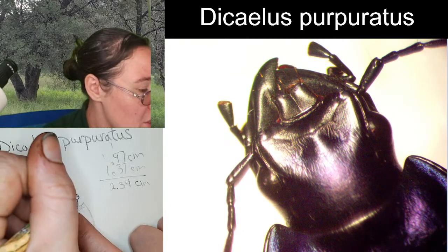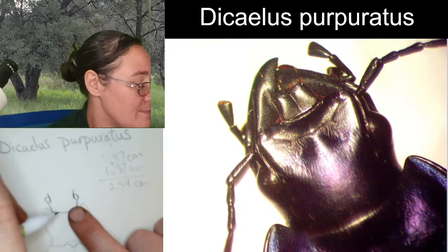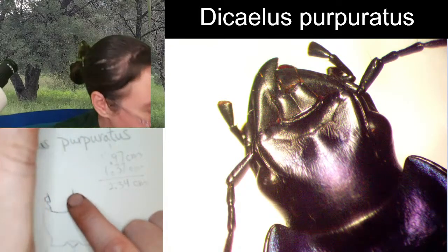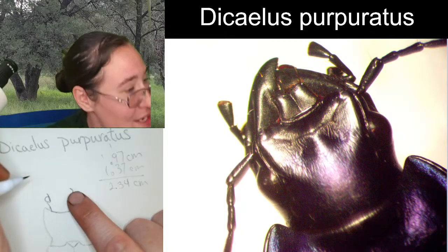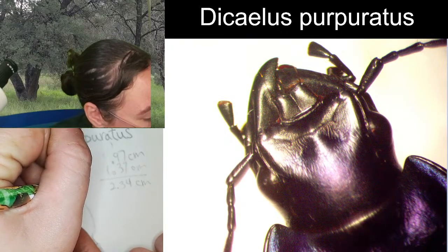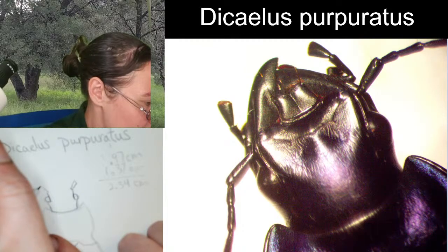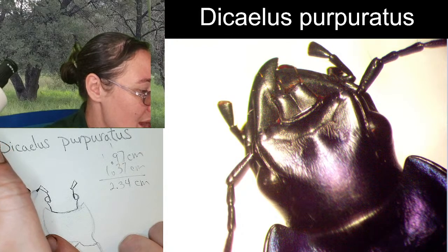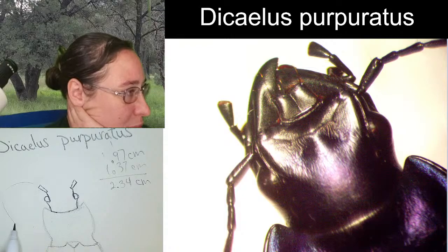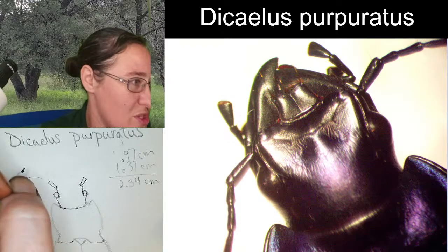So up here above the compound eye, we come straight, and then you have the scape, the first segment of the antenna. The first segment is narrow at the base. It gets a little bit wider at the end. And it's a fairly long segment in comparison to the other segments that you can see. So I'm just going to go ahead and add at least that first segment of the antenna. I'm going to probably make my antenna curl up and then back so that they're not in the way of these words here.